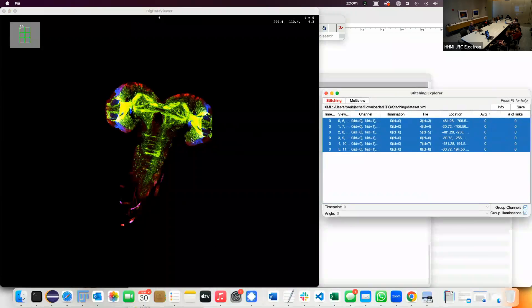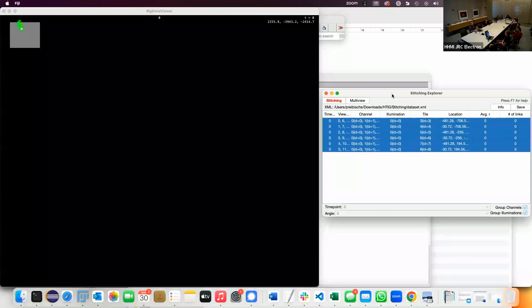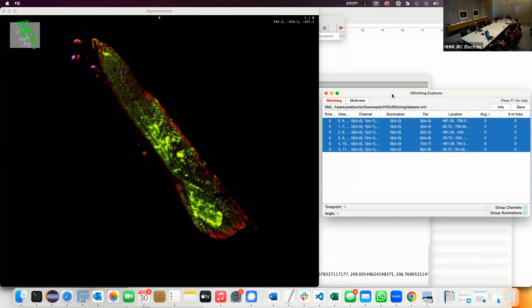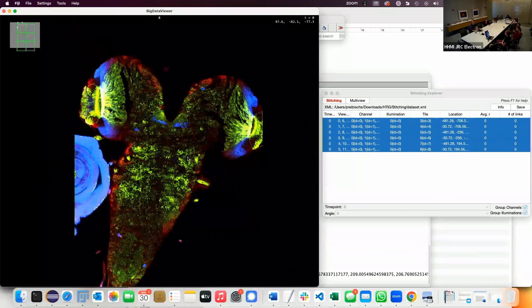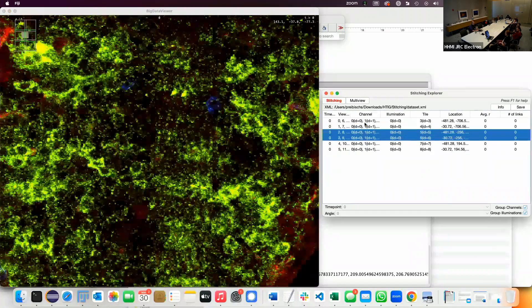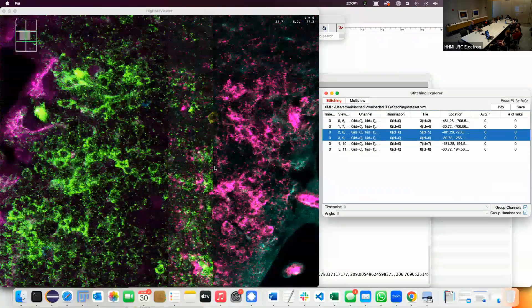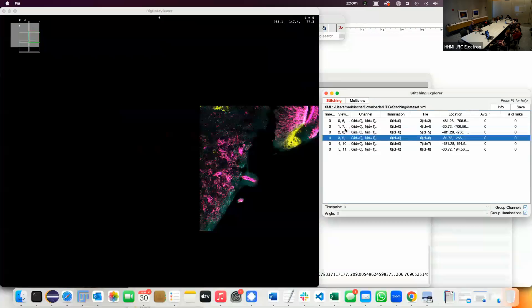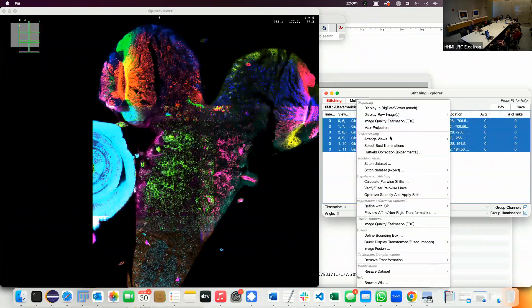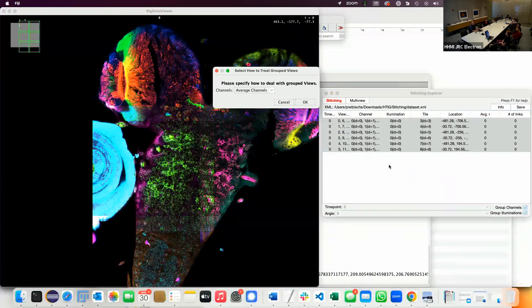So then we're starting. One thing to mention: if you get lost and your sample is gone, press R and it re-centers your sample. Very useful — you can easily get lost. So let's do the very basic stitching. You can see it's very badly aligned right now. When you press C you get different color codes where you can see this is really bad. What we do then is run the alignment. For this you do a very simple phase correlation based alignment — it can only do translation. In many cases that's not enough, but it's a good starting point. The Stitch Dataset wizard basically holds your hand through this.